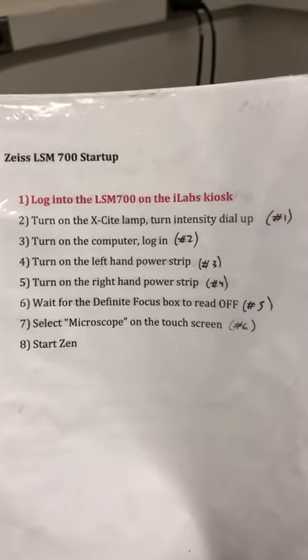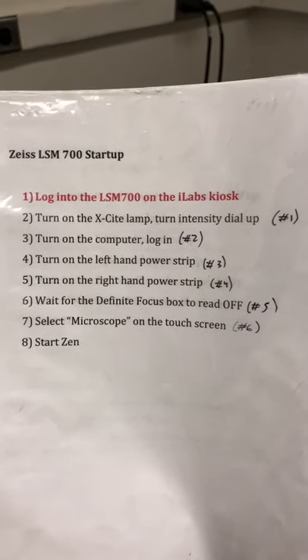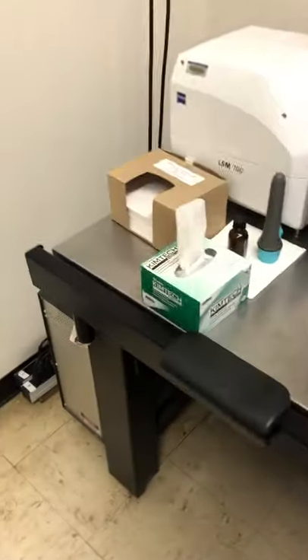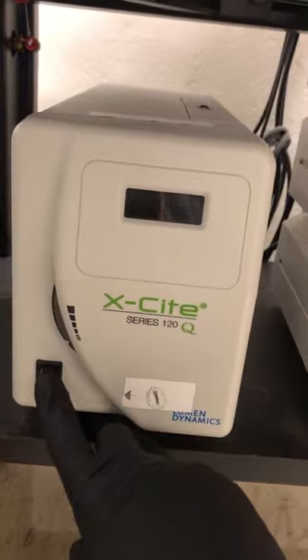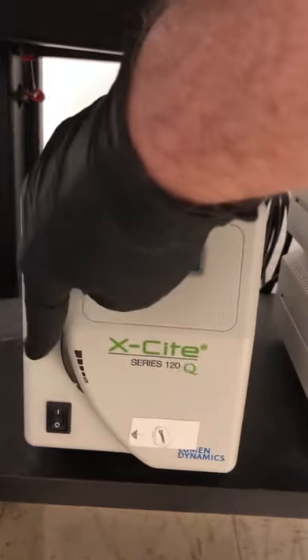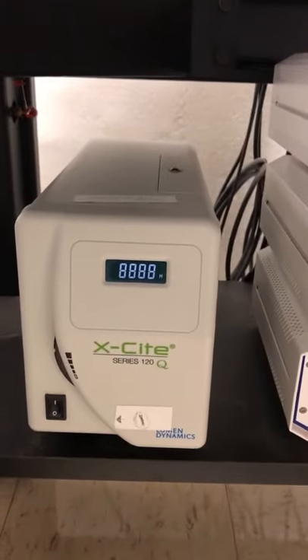The second step is to turn on the excite lamp and turn the intensity dial all the way up. That's item number one on the hardware. Let's find item number one — we're going to turn the excite lamp on and move this dial all the way up. That will allow us to see our sample by eye.